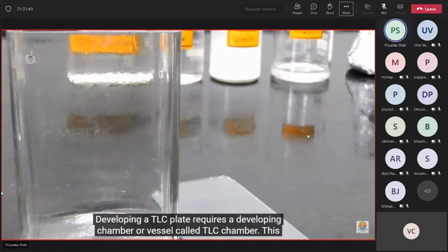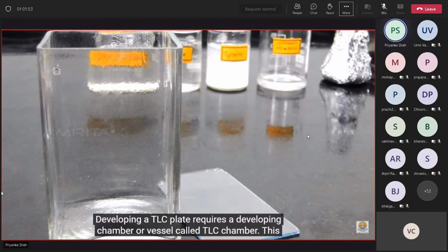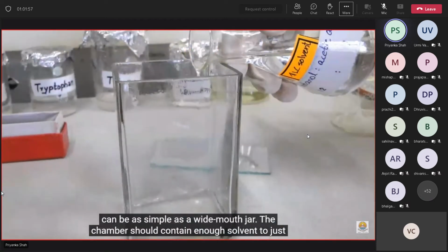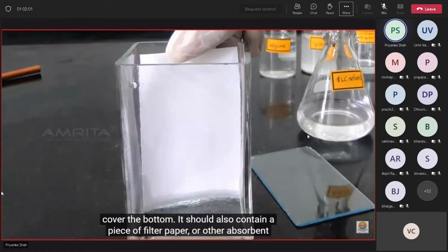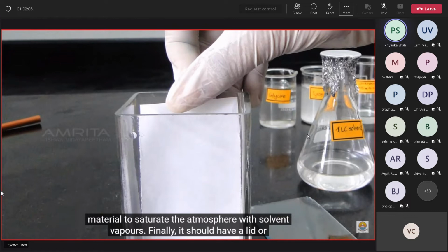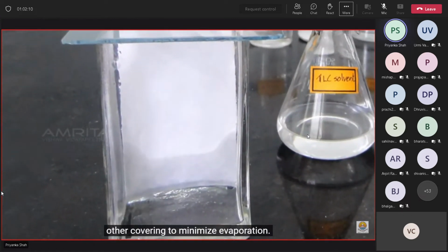Developing a TLC plate requires a developing chamber or vessel called a TLC chamber. This can be as simple as a wide-mouth jar. The chamber should contain enough solvent to just cover the bottom. It should also contain a piece of filter paper or other absorbent material to saturate the atmosphere with solvent vapors. Finally, it should have a lid or other covering to minimize evaporation.